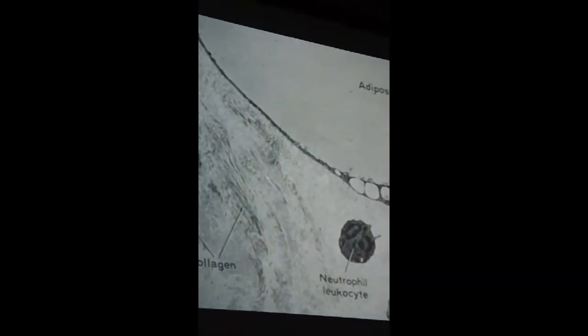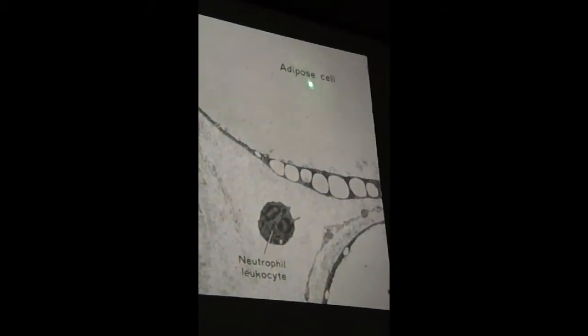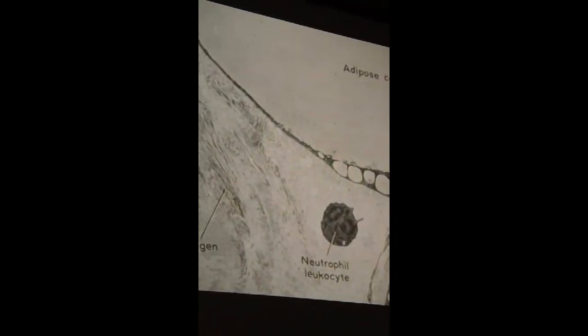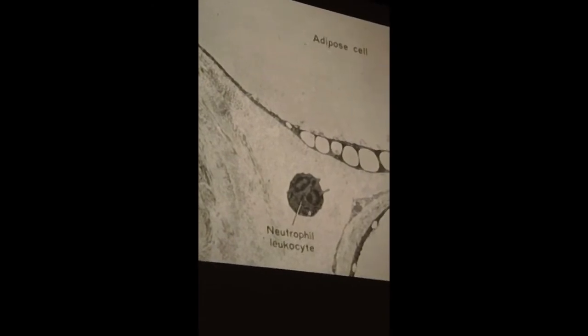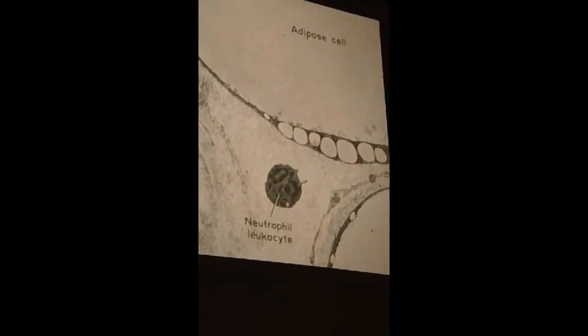Yes, I mean, that's nice. Kind of cool. Lots of little bubbles, empty bubbles. Keep in mind that the neutral lipids have been removed by the process of making this section, and all we see is this little thin cytoplasmic rim. Yes, this is a cool micrograph. Here note that the lipid is there. Here's this thin rim of cytoplasm. You see these droplets are either being extracted from the storage depot or added. I can't tell you which.